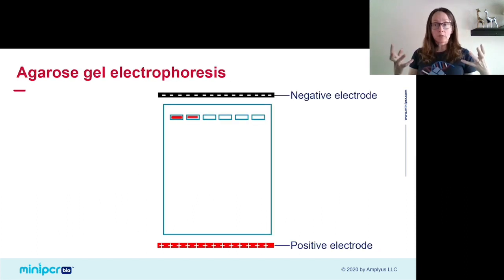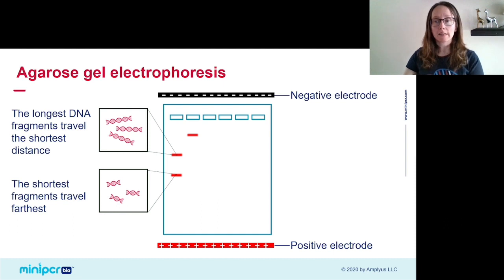When we zoom back out, this is what we'll see during the course of our electrophoresis experiment. The DNA sample we load into our gel might contain DNA fragments of many sizes, and those samples will get separated into bands, each containing a group of DNA molecules of the same size. The bands that are furthest away from the well contain the smallest fragments, and the bands that are closer to the well contain the largest ones.